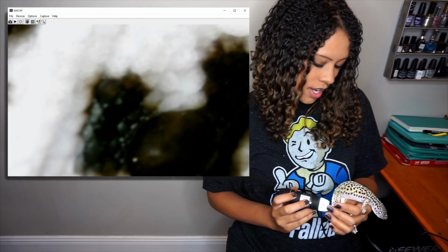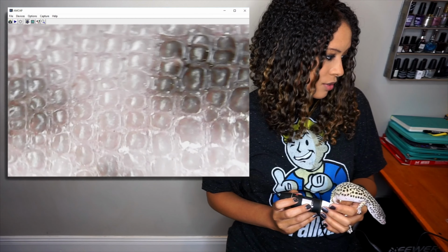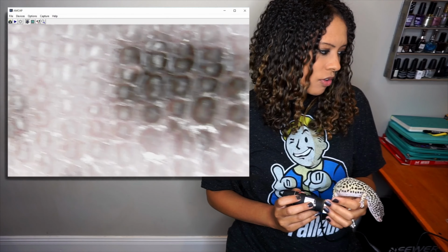Then we'll move down to her regrown tail. Tiny little scales forming. And you can see that the skin on her regrown portion of her tail is almost dry. Even when you just look at that regrown part of her tail, it looks like dry skin, like she's shedding it all the time. And I'm assuming that's because as reptiles grow, they shed. And her regrown tail is regrowing, so it's getting bigger. I'm assuming it's just in a constant state of shed.